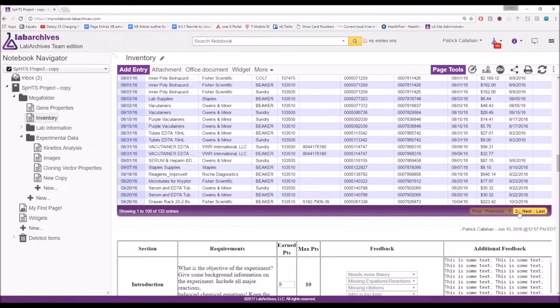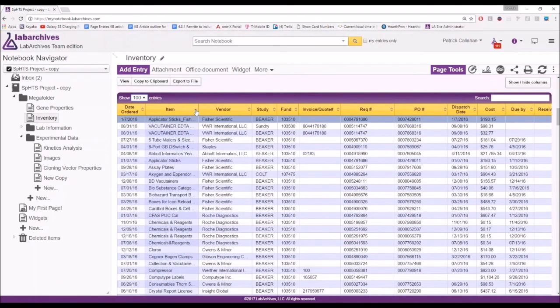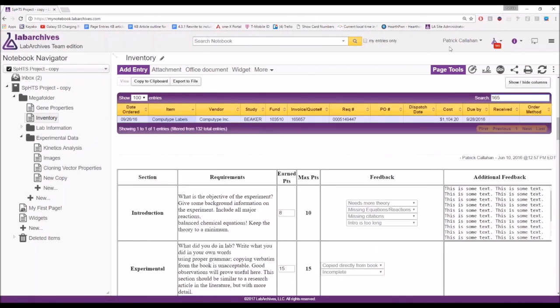And you can even do things like alphabetize and reverse alphabetize each row. See, when I click these arrows, it allows me to alphabetize and reverse alphabetize. I can search for some specific row. So if I just start typing, that's isolated as one out of 132 rows very, very quickly.